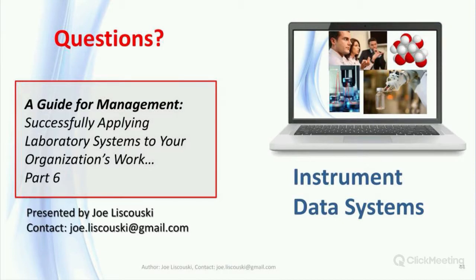No, aside from just inviting you into the next session, which is going to be June 21st, what we're going to be doing is looking at sample preparation, the processes that are involved, the science that's involved a bit, and we're going to take a good long look at how guidelines and regulatory requirements play into that. Process roles, process analysis. Basically, it's going to finish up the procedure that we started off looking at how data is managed, and now we're looking at how it's generated and how samples are being dealt with. So that session is going to pretty much tie the whole thing up into one ball.